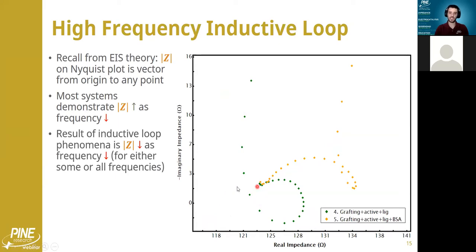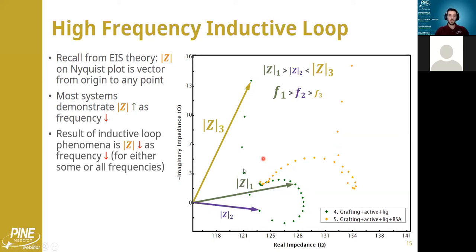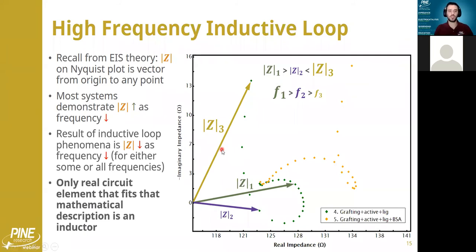So looking at it through the lens of what I just mentioned in terms of the vector and that distance being my impedance magnitude, what I can see is that as I move along my Nyquist plot I go from some value to a lower value. These points are getting closer to the origin and then they get farther away. So for some period of time I have the reverse trend. As the frequency drops the impedance also drops, and then as the frequency continues to drop it goes back up.